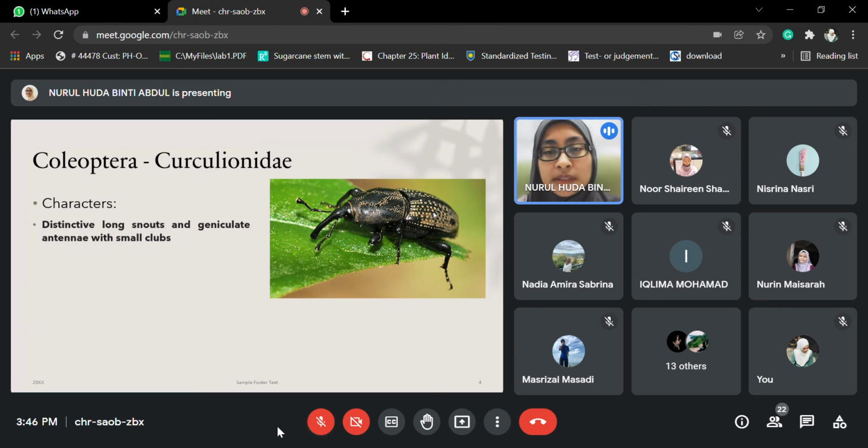If you can imagine, its mouth is at the end of the rostrum.